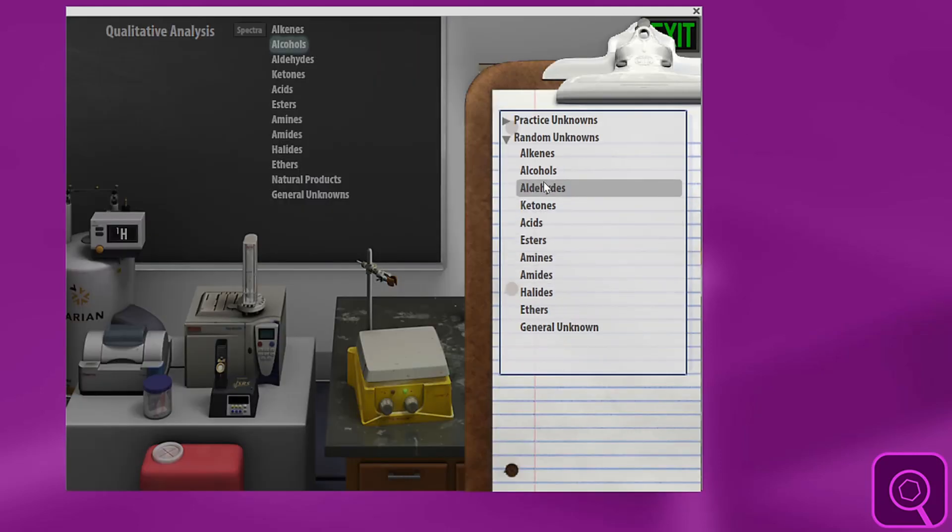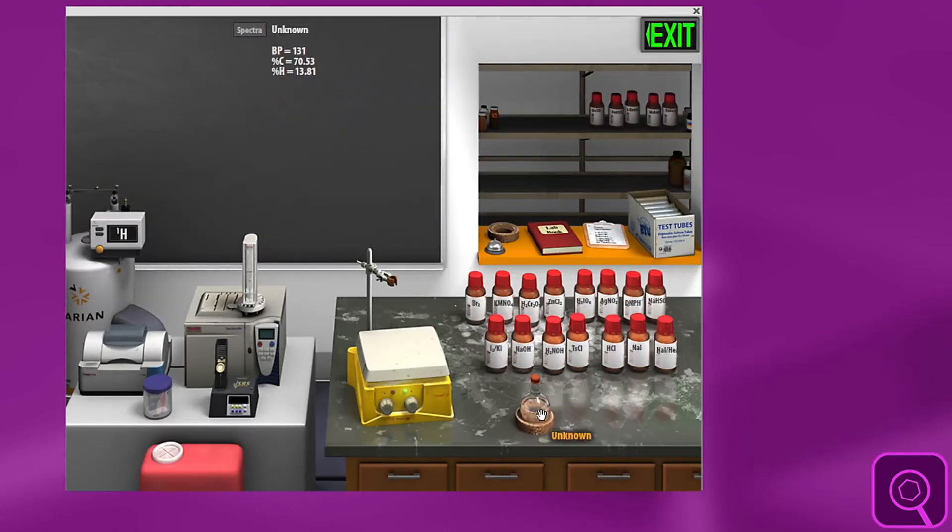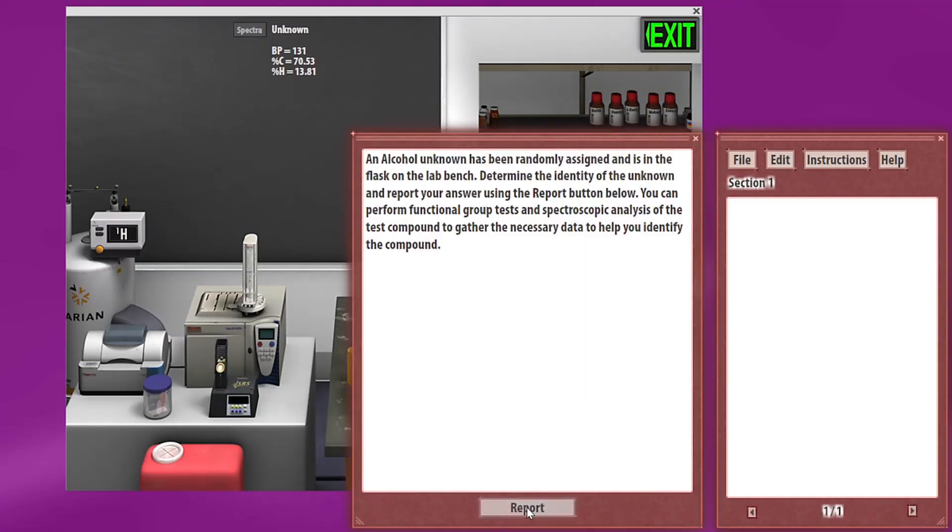The random unknowns, when a student clicks on those, prepare a round bottom flask with an unknown with no number on it. So the student would do all the tests, determine what they think they have, and then the way to report what they have is by clicking on the lab book, clicking report.